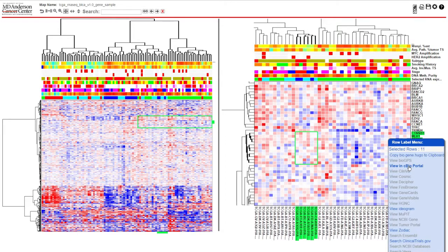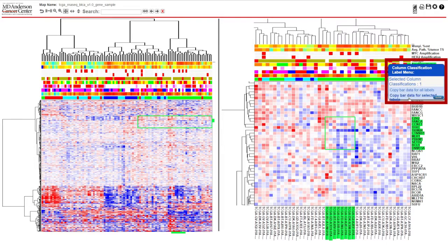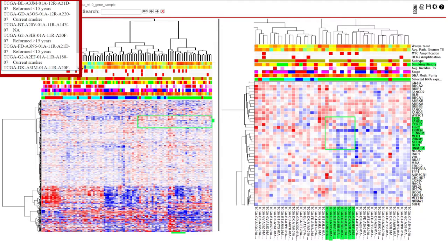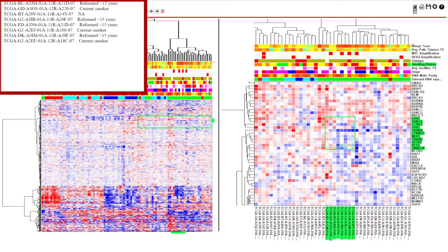If your heatmap has covariates, you can also use the information by left-clicking on the covariate you wish to view, and then right-clicking on the name and selecting 'copy bar data for selection.' You must have a row and column selected to view the covariate information. This will open the covariate information in a new window.